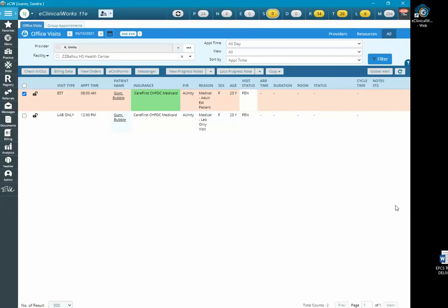So please make sure, again, that you fill out the 6 mandatory fields and you become the second eye for the provider. If you do that correctly, then the actual lab results will be transmitted back to the provider's Jelly Bean.